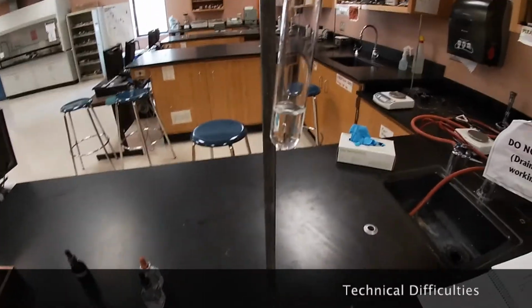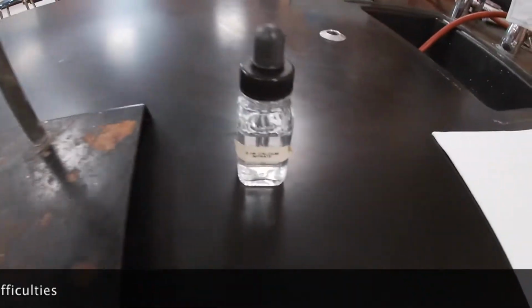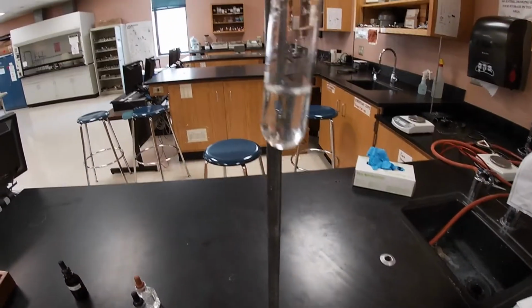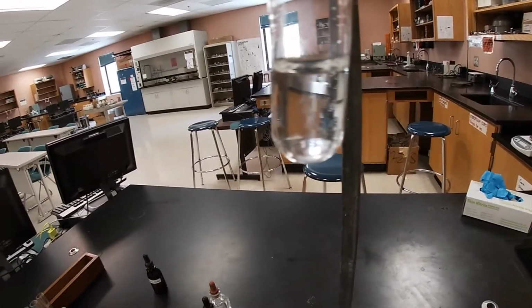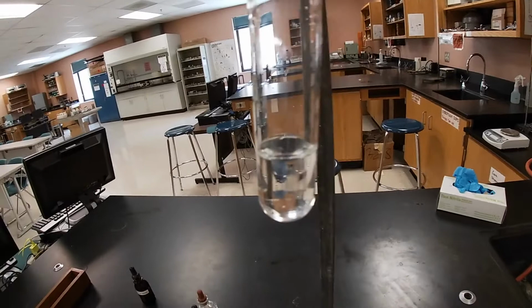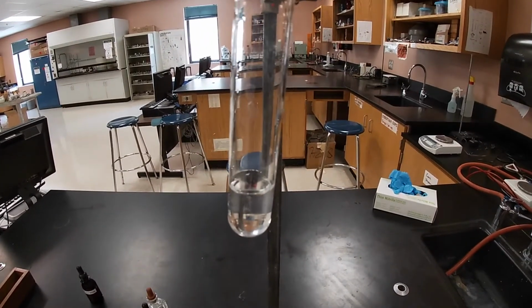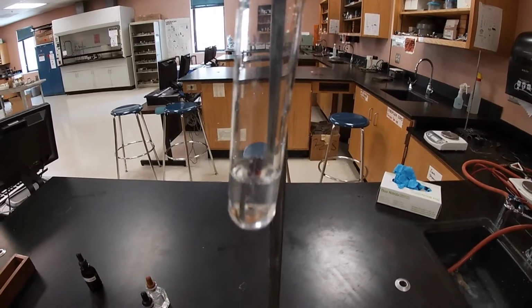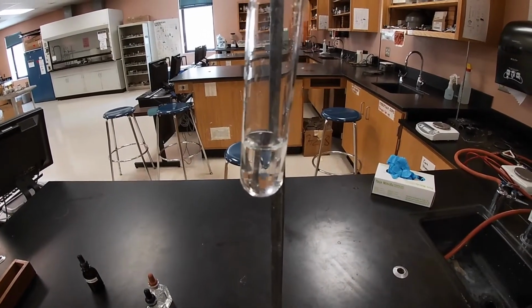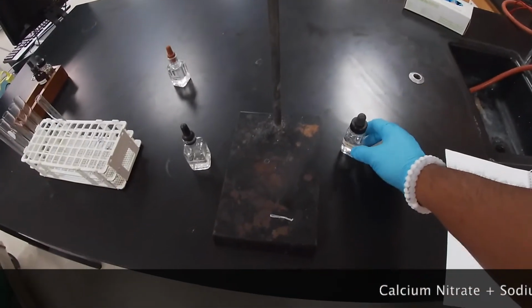Hopefully we can get a drop after the addition of our sodium chloride solution. We got our calcium nitrate, we added both solutions in there, and as you can see, we still have a nice and clear solution. So again, nothing occurred in this one. Take down your observations and the formula of an insoluble salt, if any. In this case, none. Okay, so we're going to try that again.